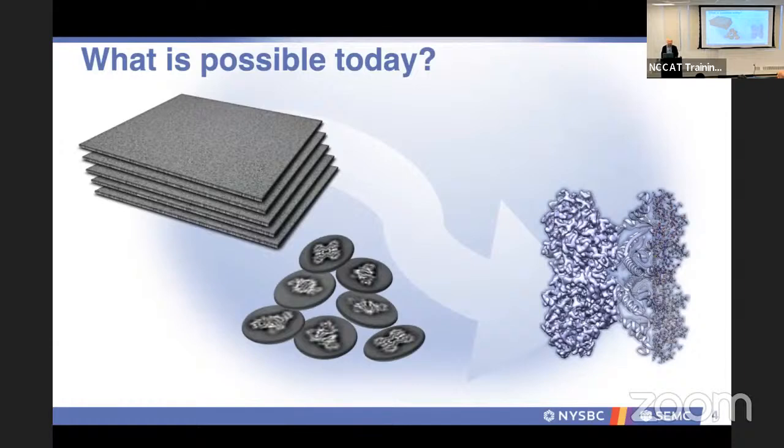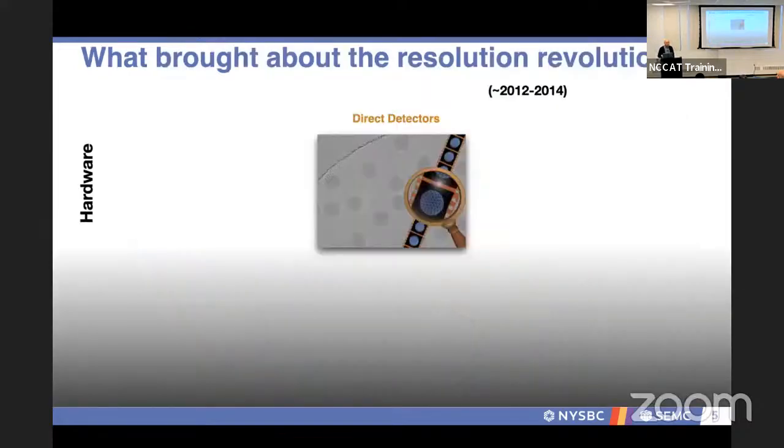When people think of cryo-EM, they primarily think of the modality of single particle analysis, primarily because you can go from images to reconstructions within a matter of hours, aspirationally. And we heard about the resolution revolution, and there were a lot of developments. So direct detectors are claimed to be one of the main pillars of that, because on a standard microscope, if you add a direct detector, you go from sub-nanometer to all of a sudden angstrom scales.